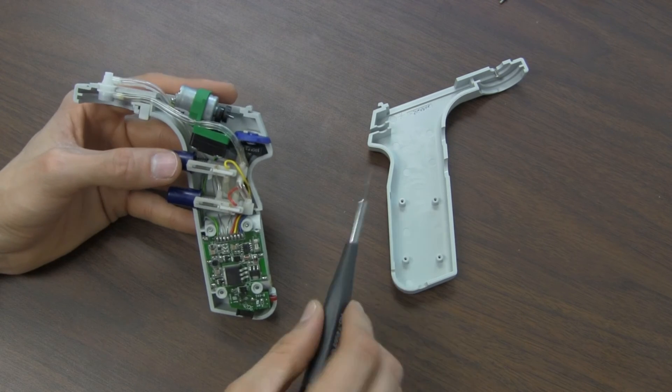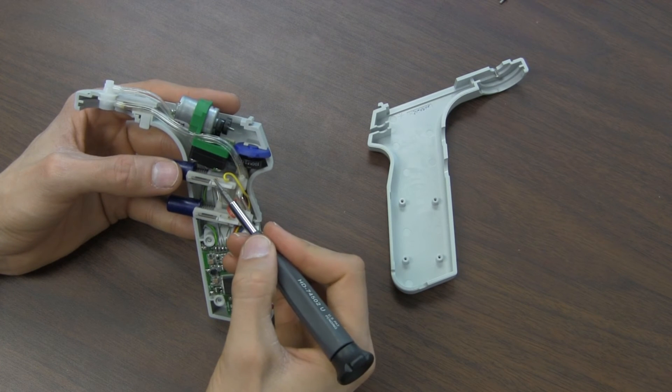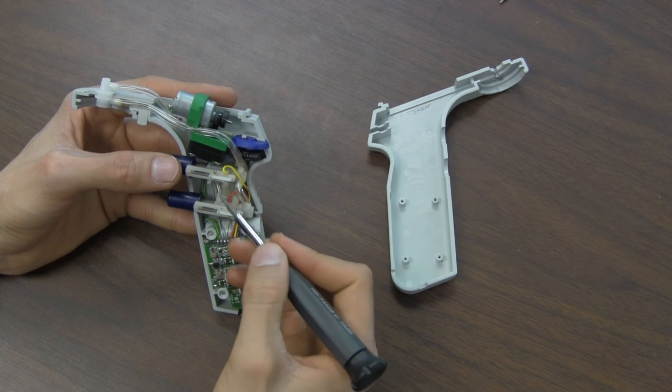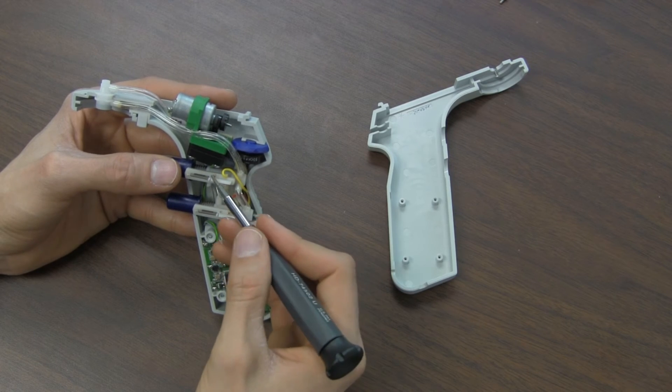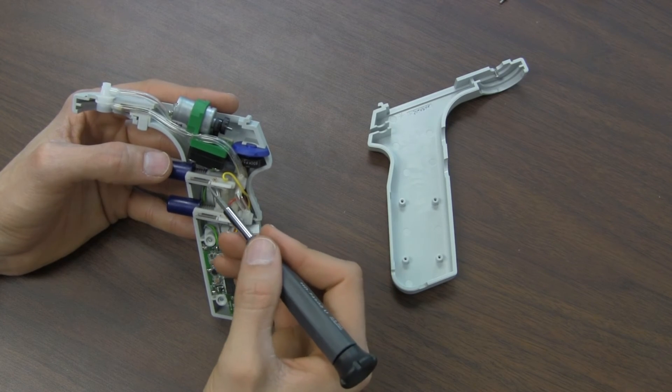And while it's open, it's a good thing to clean off these contacts here, right here and here, because it's a common point of corrosion and failure mode that the buttons don't work well anymore.